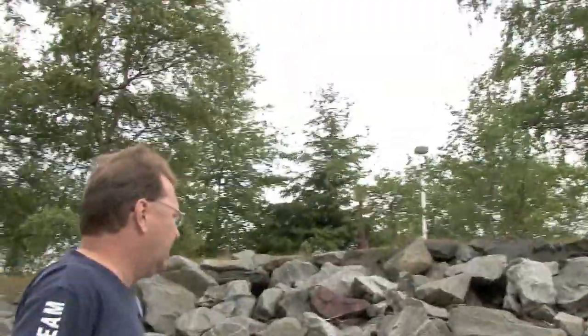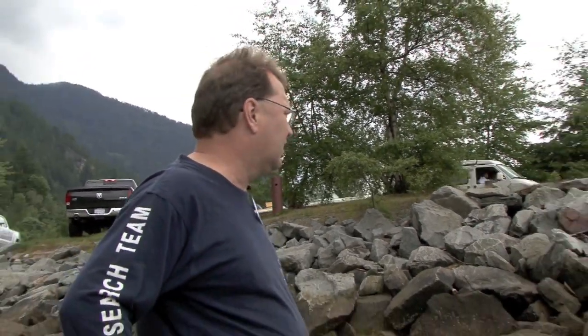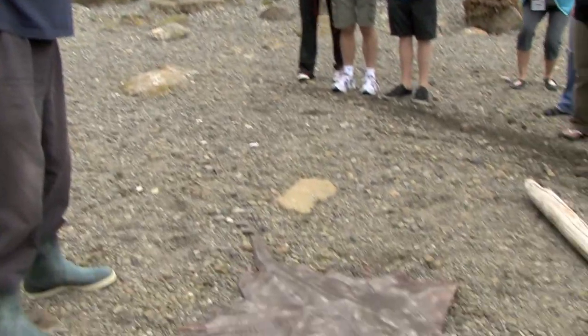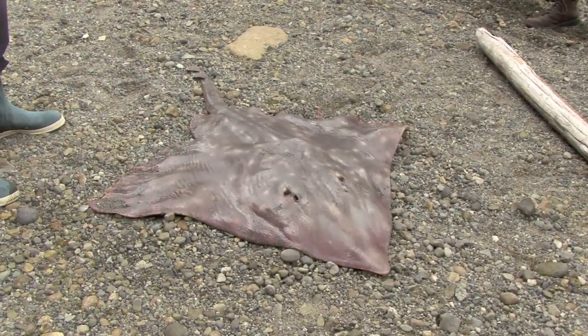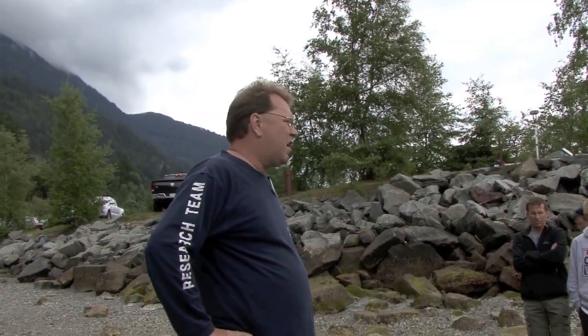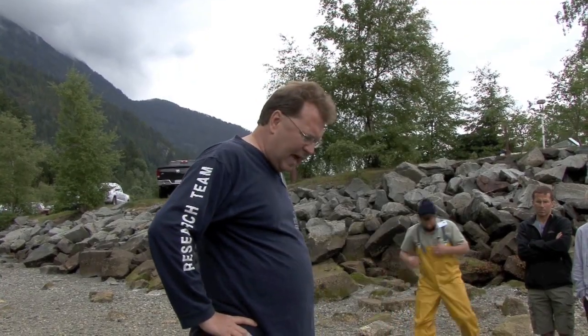This is Raja binoculata. Skates tend to be more of a northerly group. We start seeing stingrays and rays a little farther south than here — California. This is not a fully grown animal. These guys get up to two meters across at about 90 kilos. They're invertebrate feeders — they feed on hard-bodied invertebrates: crabs, mussels, things like that.